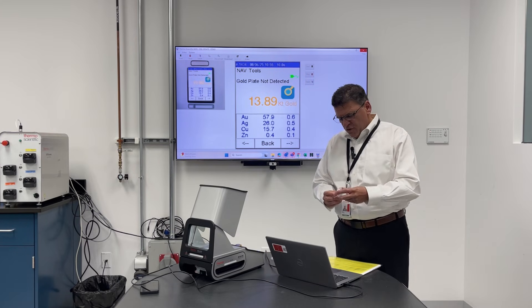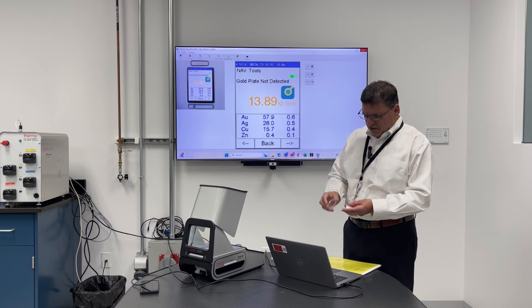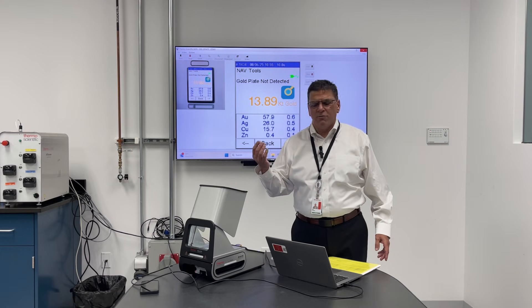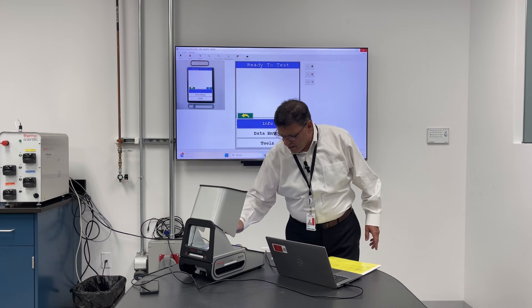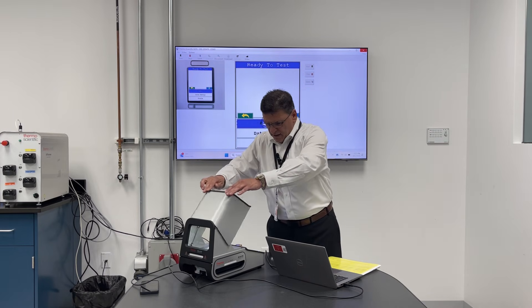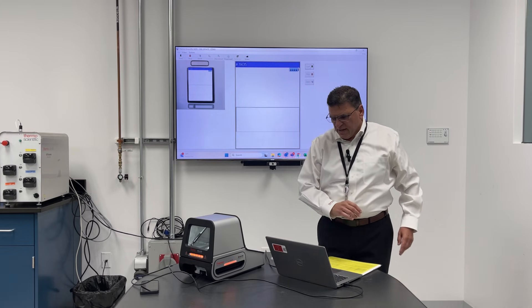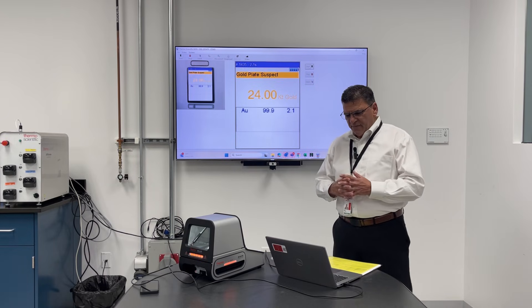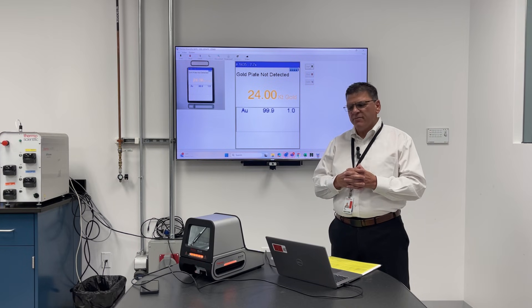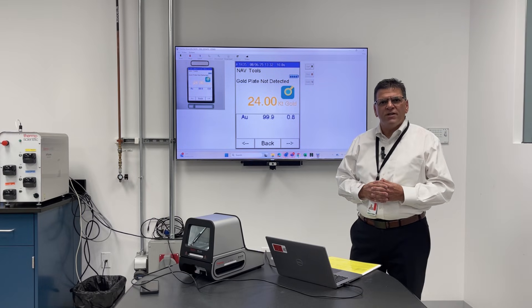Here we have two reference standards to go through the analysis. This first standard is a certified standard and it's 99.9% gold. As we offer it up, it's got a camera — line this to the center of the DXL800, close the lid, and simply start the analysis. As you can see, it's going through the analysis: the X-ray hits the surface, exciting the atoms, and what comes back is a spectrum. From a very complicated algorithm and detector, it's telling us that it's 99.9% gold.